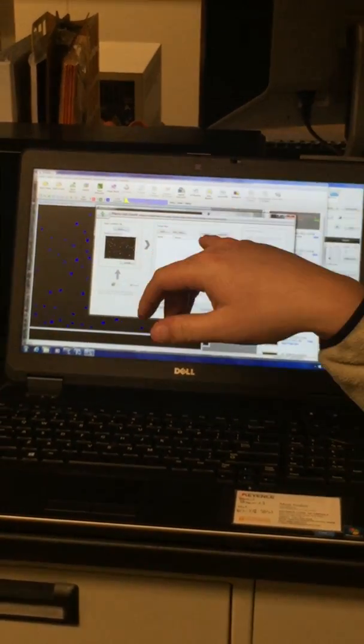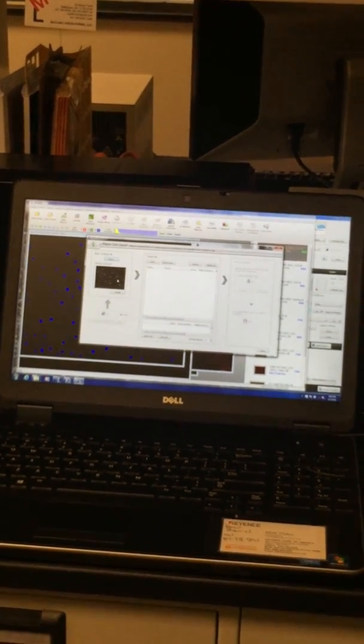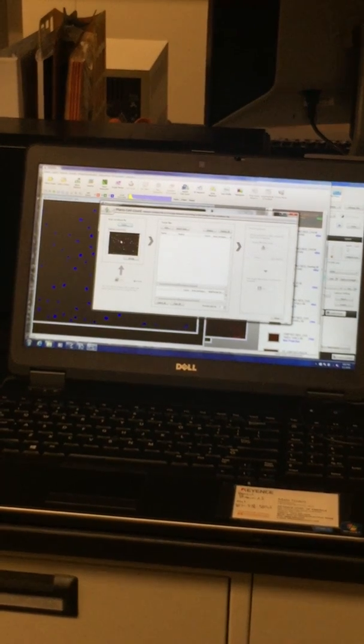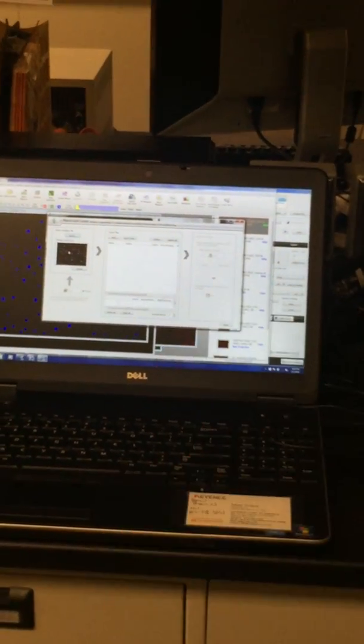You can actually add in up to 400 files right here. Click run, and it's going to count all of those files with the exact same settings that we just used to count this one file here. So I know when I'm working at some of the bigger universities, the counting and the quantification is a job that gets designated to undergrads or grad students, so they don't have to do it anymore. So yeah, that's pretty much how that runs.